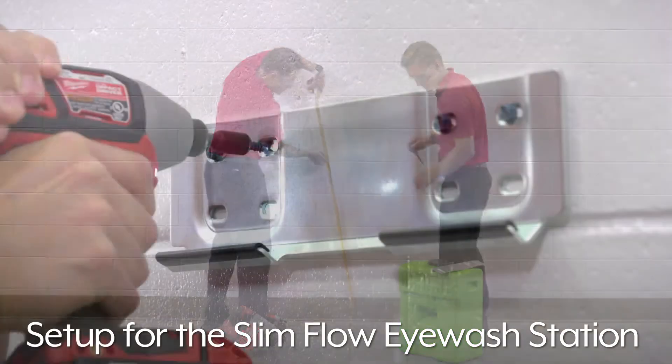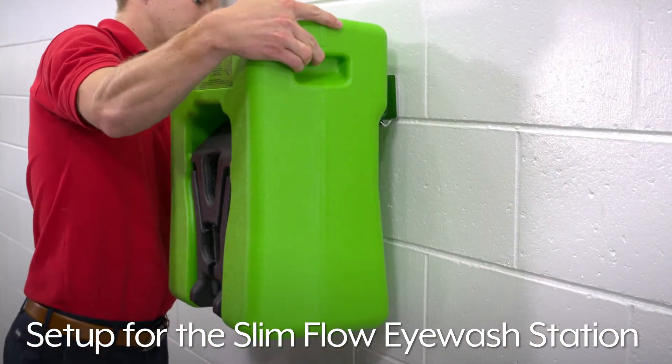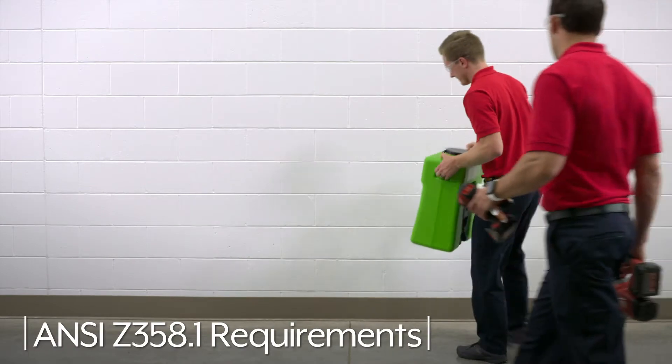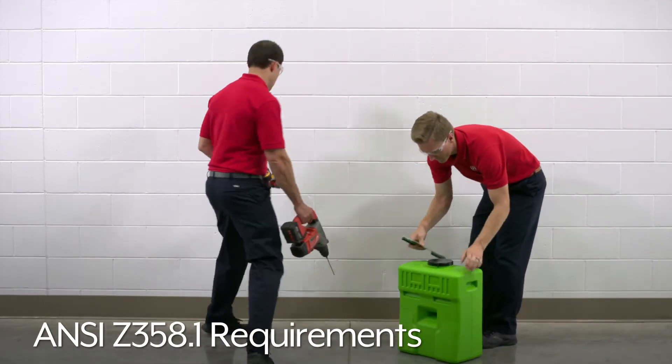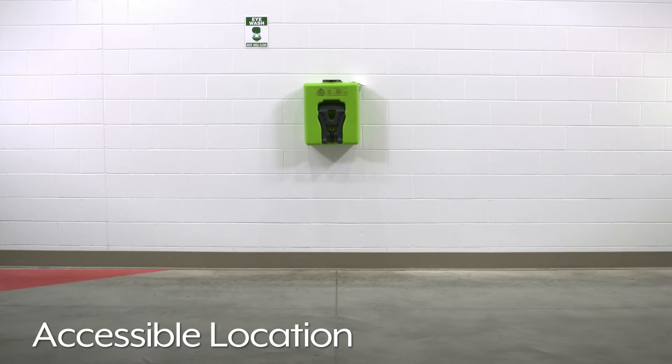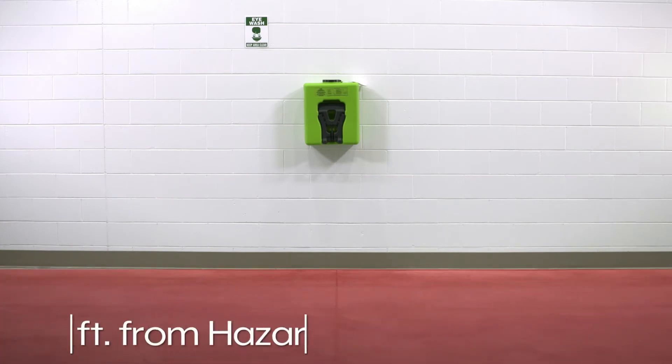This video will show you how to install and set up the Uline Slim Flow Eyewash Station. First, select a location that meets the ANSI Z358.1 requirements. The station must be in an easily accessible location within a 10-second walk or 55 feet from the area of a potential hazard.